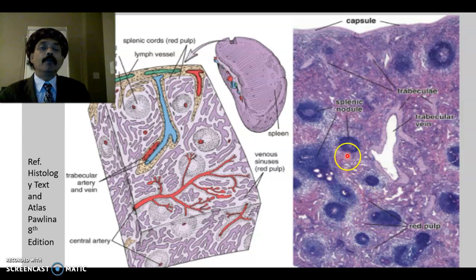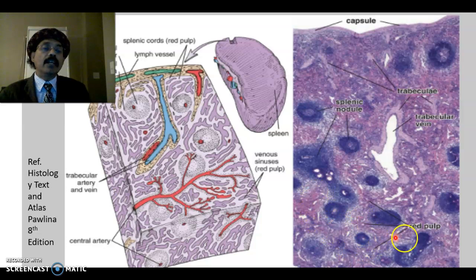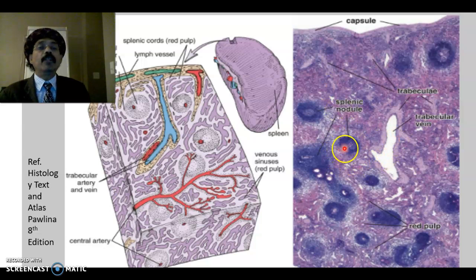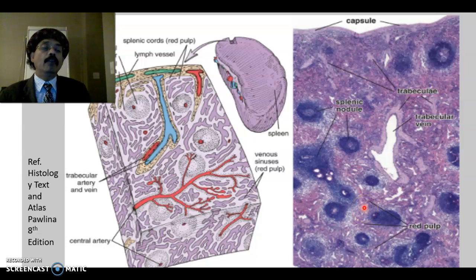This is the red pulp. The splenic nodule forms the white pulp, and the rest part here is the red pulp. We have the trabeculae, trabecular vessels, and the splenic nodule with germinal center. In between the nodules, we have the red pulp, which contains the sinusoids and the splenic cords.